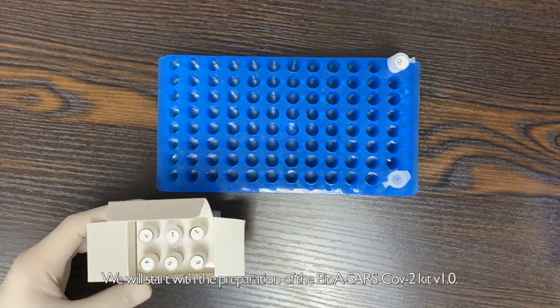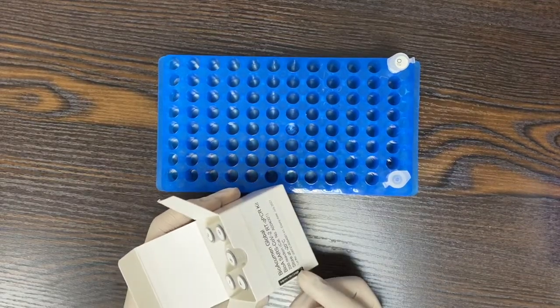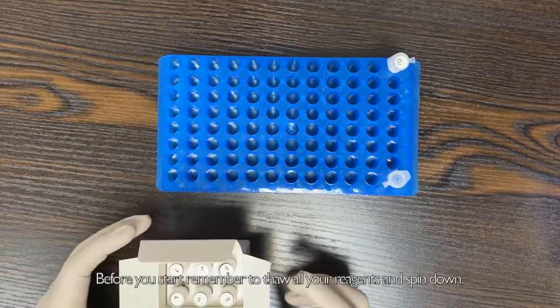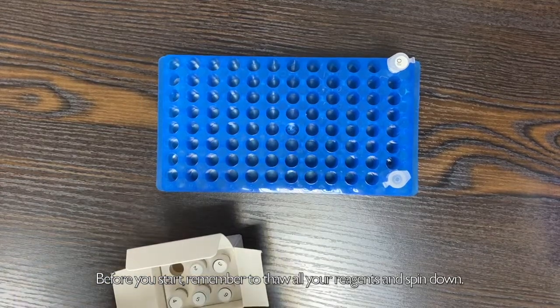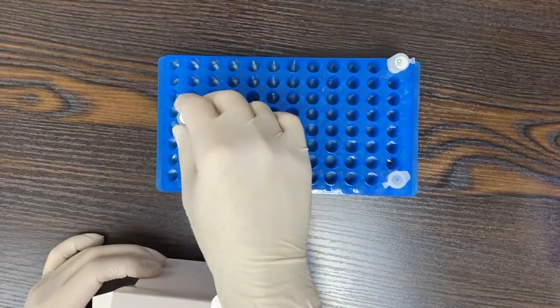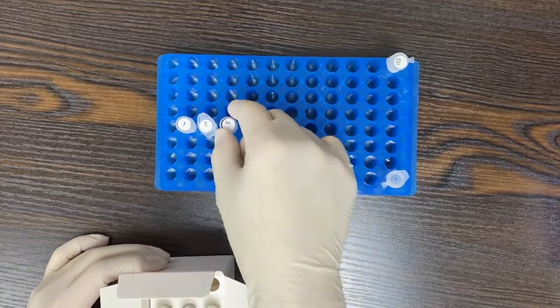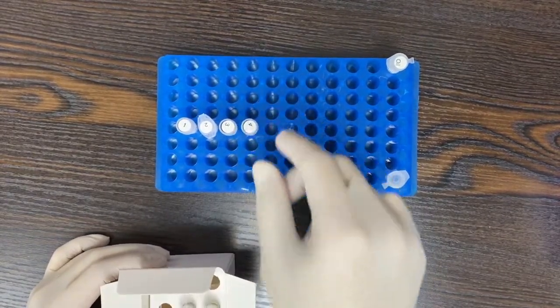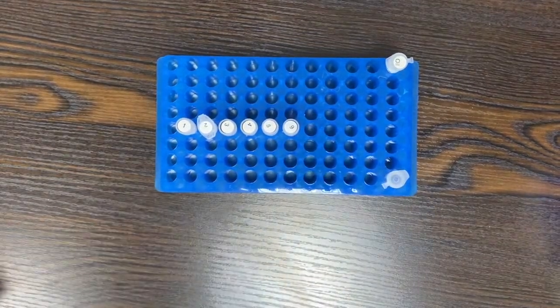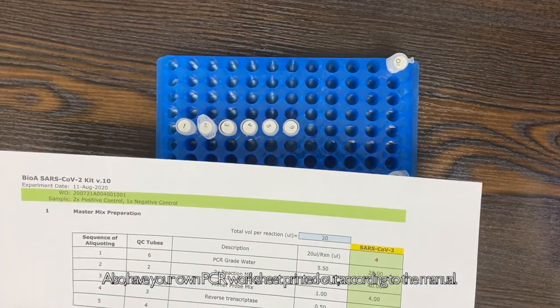We will start with the preparation of the BioA SARS-CoV-2 kit version 1.0. Before you start, remember to thaw all your reagents and spin down. Also, have your own PCR worksheet printed out according to the manual.